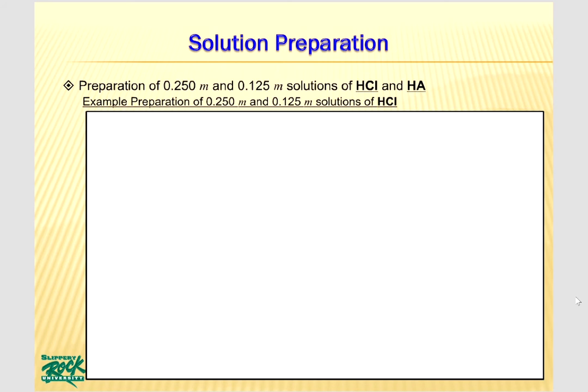I will show you how to prepare a 0.250 molal and the 0.125 molal solutions of hydrochloric acid as an example. You should follow the same procedure to prepare the same concentrations of monochloroacetic acid solutions.